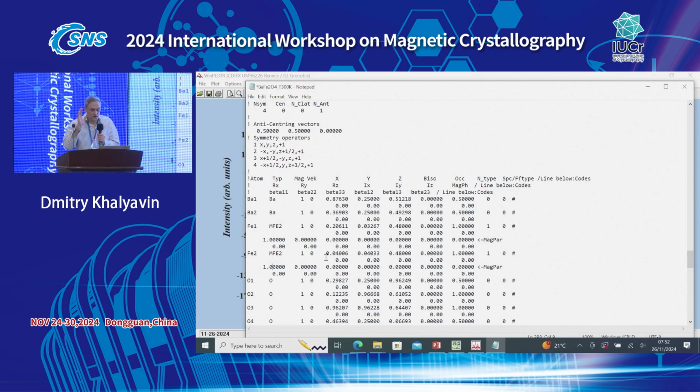If it crashes, then we will fix something and use fewer parameters. Again, I don't know what is a good start, what is a bad start. But 6 parameters is not a lot. We have a lot of magnetic peaks and very good quality data. So we can try 1, 1, minus 1.